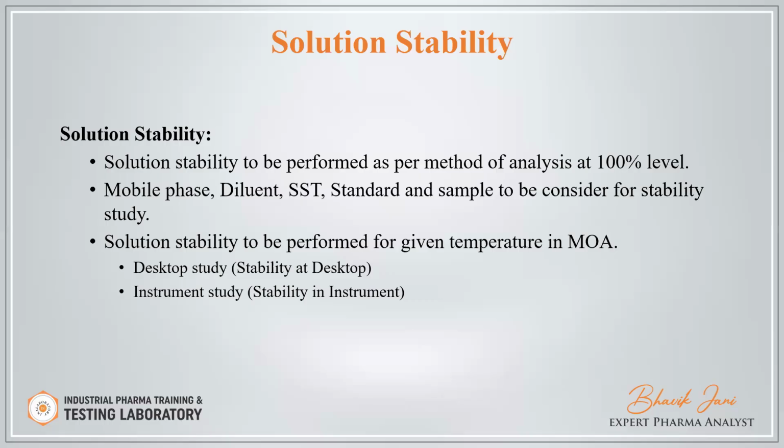Solution stability is to be performed at the given temperature in the MOA: a desktop study, stability at the desktop, and the instrumental study. You have to perform both studies. You fill the vial and keep it in the HPLC rack, and you have to perform the solution stability of the desktop solution also.